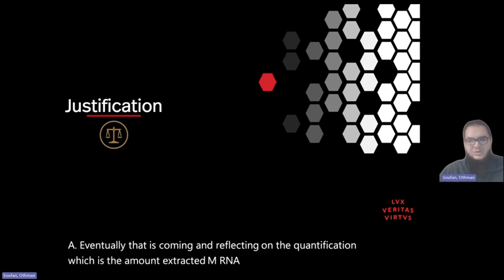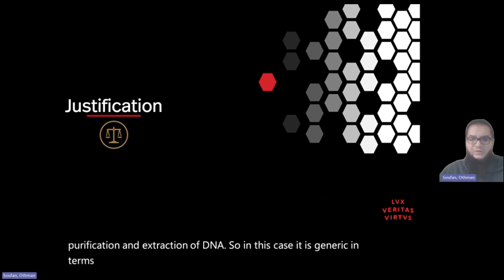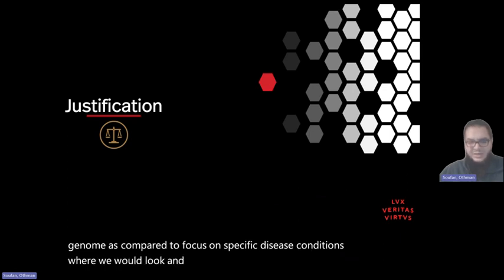So certainly when you start speaking about genome, we are looking into the purification and extraction of DNA. In this case, it is generic, in the sense that we are trying to go to the reference book, that full library of the genome, as compared to focusing on specific disease conditions where we would look into mRNA study and analysis and so forth.